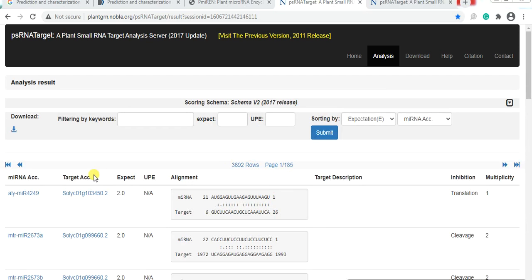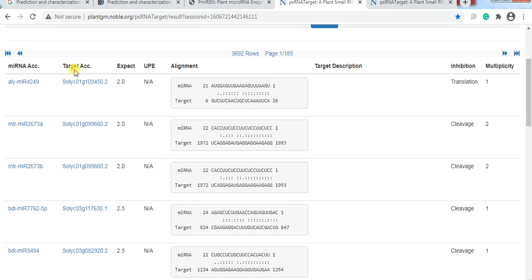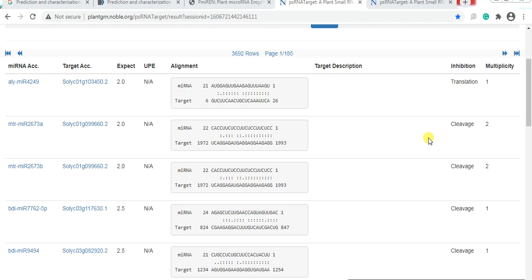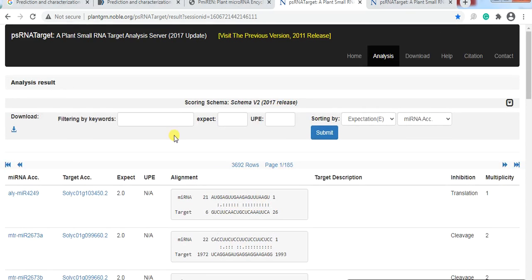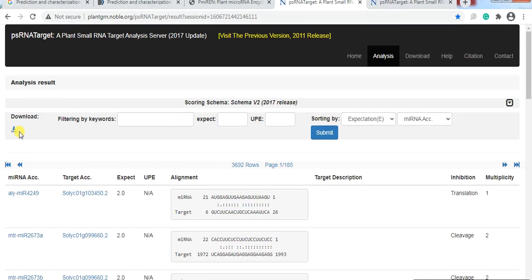When it completes, it shows microRNAs that were discovered across all cloned species up to now, and their targeted sequences found within our target gene. You can download these results just like before and save them to your destination folder.